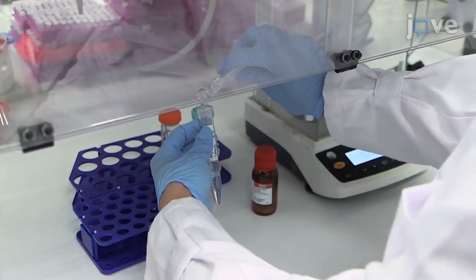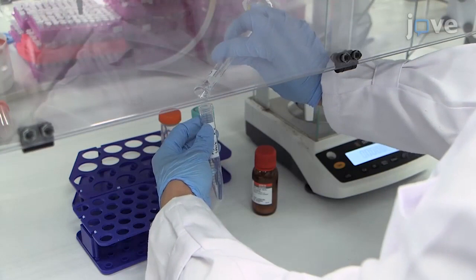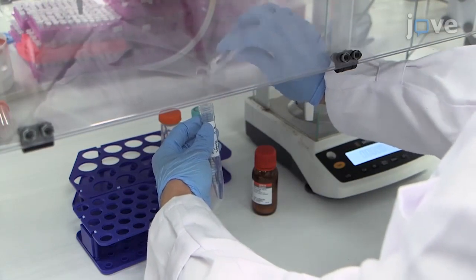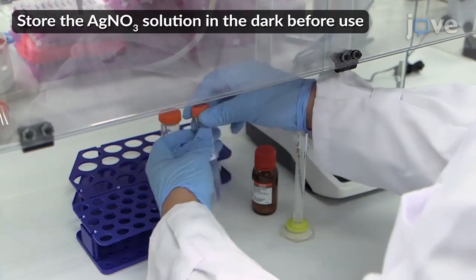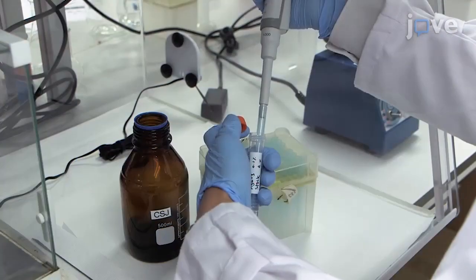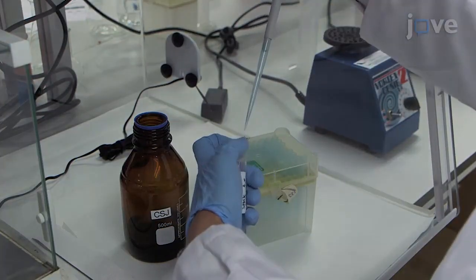First, dissolve 0.01 g of silver nitrate in 10 mL of ultrapure water to prepare a stock solution with a concentration of 0.1%. Add 100 µL of this stock solution into 100 mL of ultrapure water.